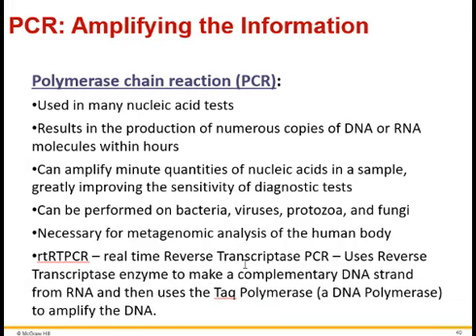Is it weakly positive, or do you have a lot of the antigen? Do you have a lot of the virus in you? And so if you have a CT value of less than 35, then that means possibly positive. If it's less than like 25, that's probably stronger, because that means you had to go through fewer cycles before you got a positive result.